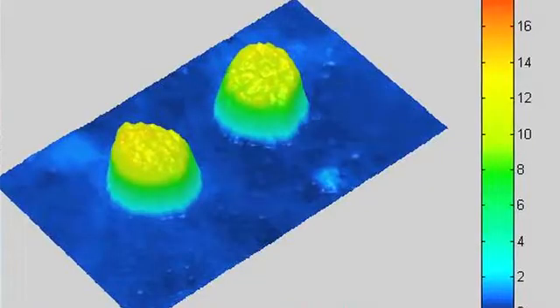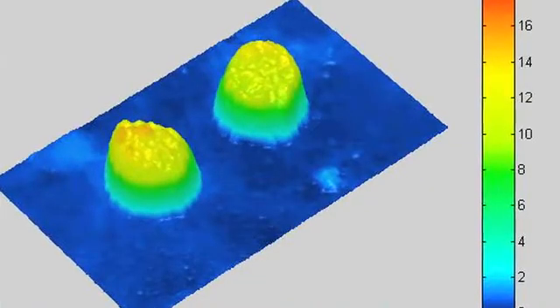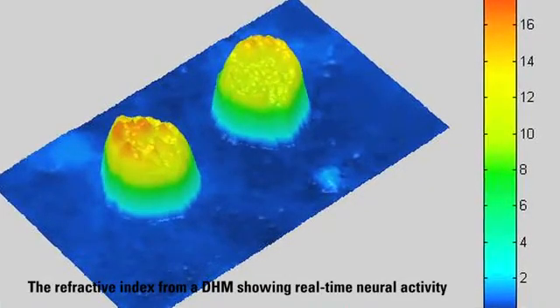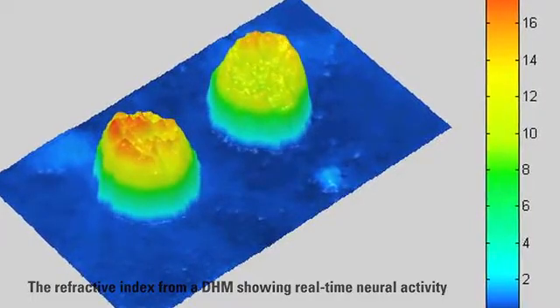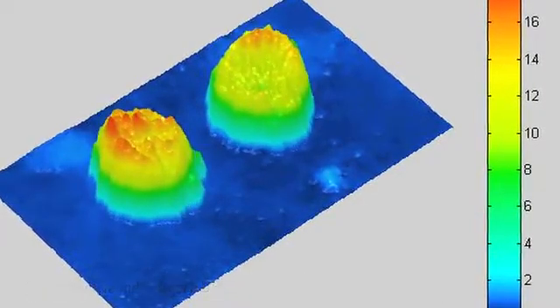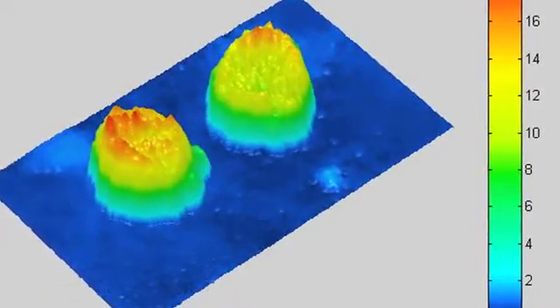Digital holographic microscopy uses coherent light — meaning a laser — that we send through the cell, collect the information, compare it to a reference beam, and this reconstruction allows us to define and visualize the shape of neurons in a dynamic fashion.